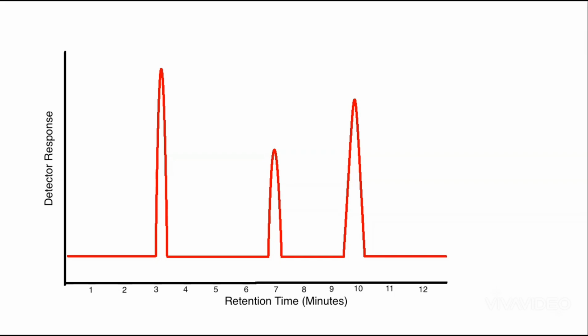To give you a little bit of background for GC, when you have a GC instrument, you take your sample, which could be a gas or a liquid, up into a micro syringe, and then you bring that over and inject it into the GC port. The GC port, or the injection site, is going to be heating at a very rapid pace, so it's going to have a high temperature. The goal, once you inject that in there, is to get whatever is in the mixture to go into a gas phase. Once it is in a gas phase, it's going to continue to be pushed by what's called a carrier gas. That's usually just some sort of inert gas like helium or nitrogen that carries the other gases through a very long internal column. It's like a pipe that's twisted up for many feet inside of the gas chromatograph instrument.